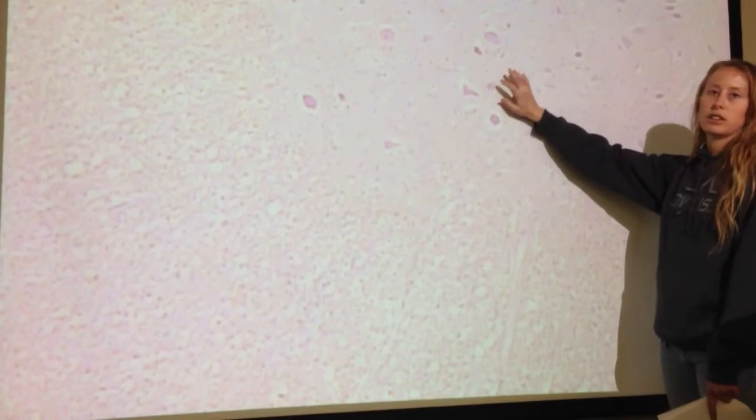You can see that right here we have our anterior column. This is going to be in between the two wings that we have, that gray matter. So this would be the column. This would be the anterior, or sorry, the ventral column. That's something weird coming off. Yeah, so ventral column. This is the anterior horn. It doesn't go all the way to the edge. You can see that it stops right here, right?